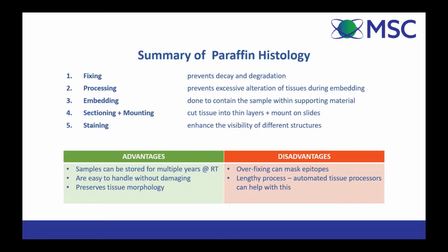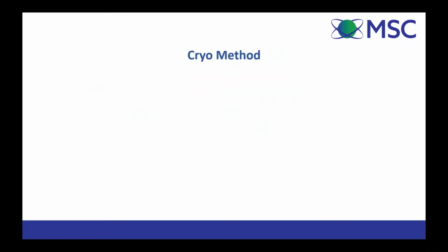However, I'll talk about it in a little bit, but there are ways around this, and I did it all the time, so it's not even a big deal. You can circumnavigate this. It's also a lengthy process. As I mentioned earlier on, if you've got an automatic tissue processor, this can help greatly and allow you to do other things while you're waiting on your samples to be done.